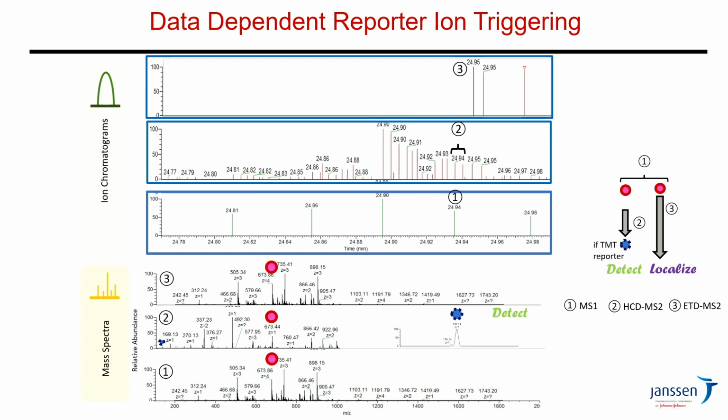So within the elution profile of a peak, you can see that we can collect MSMS data on the peptides that contain the drug quite selectively. All this happens based on this logic of reporters that we specify in the analysis. And this can only be done currently on a Lumos instrument, unfortunately.